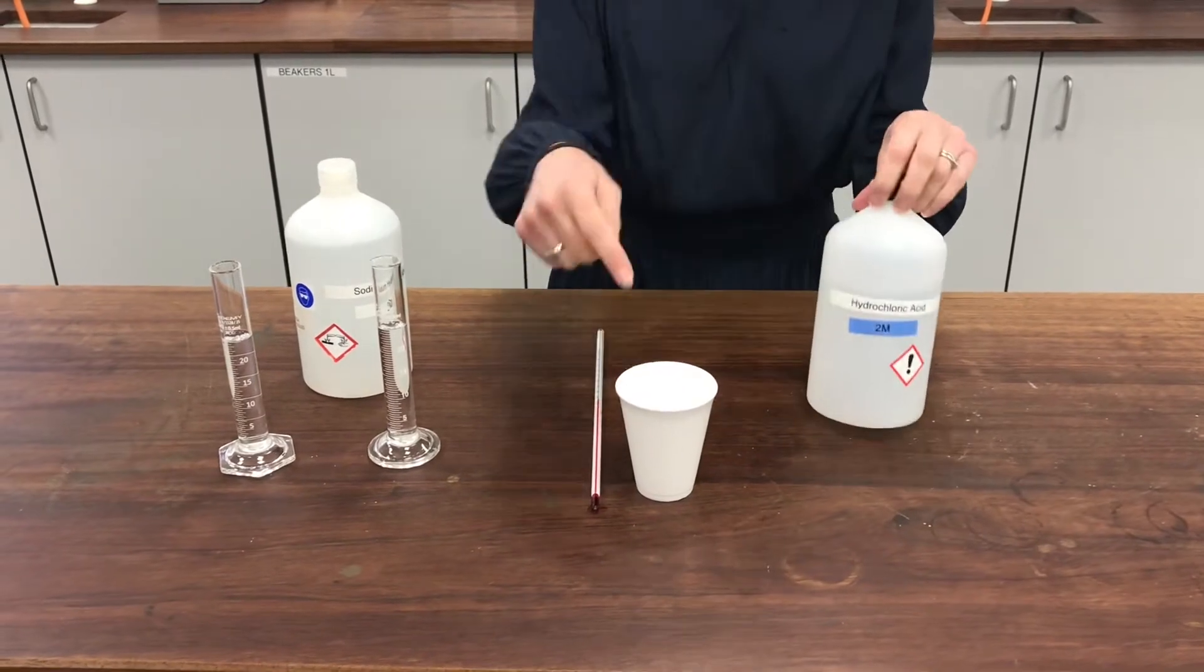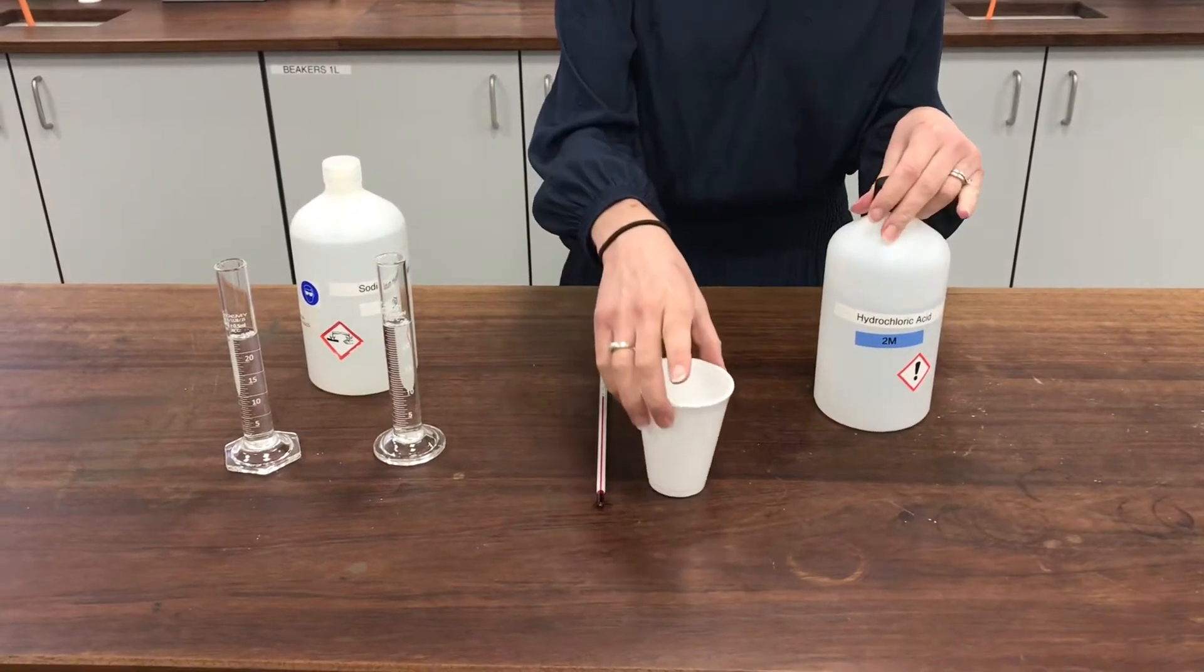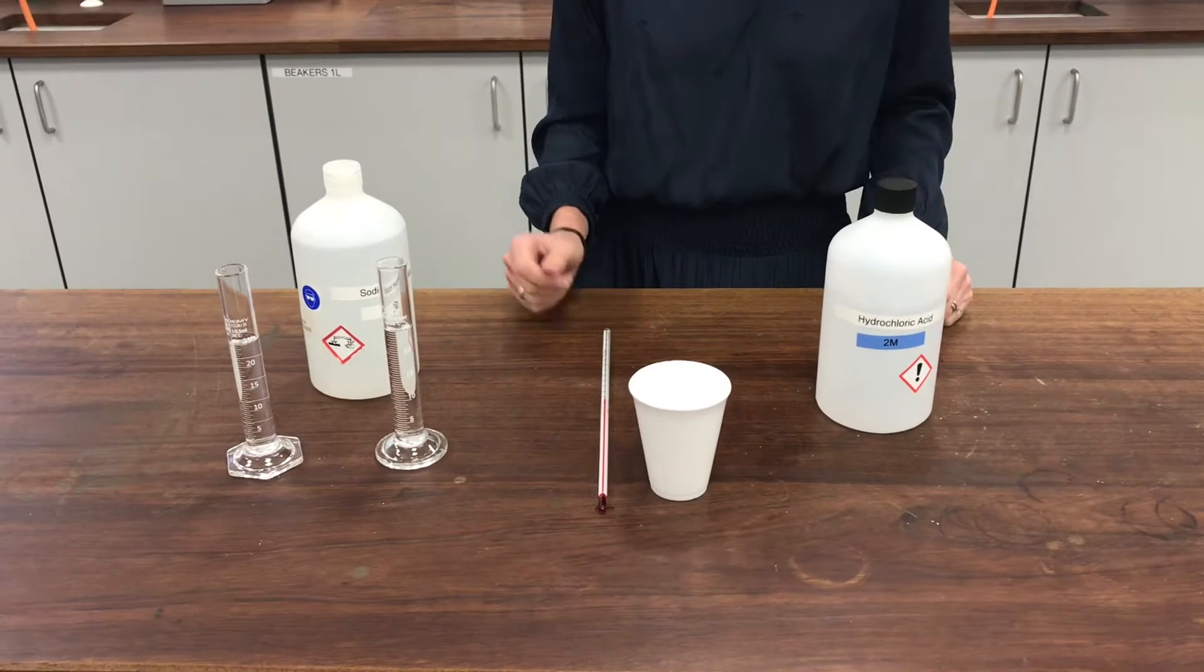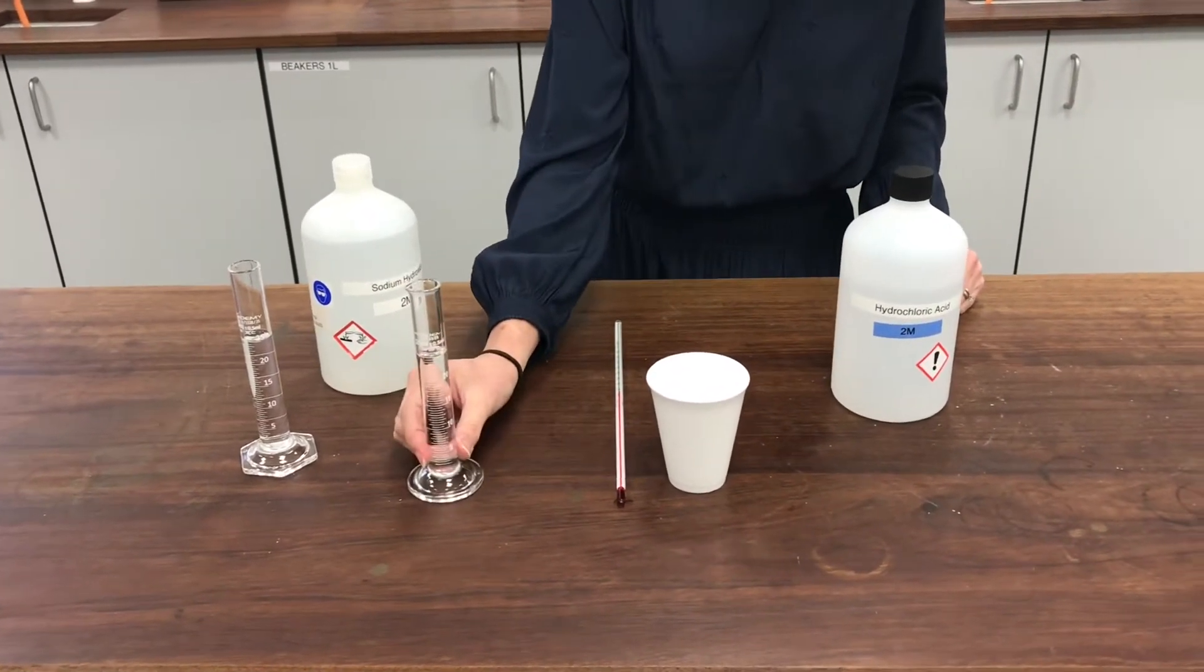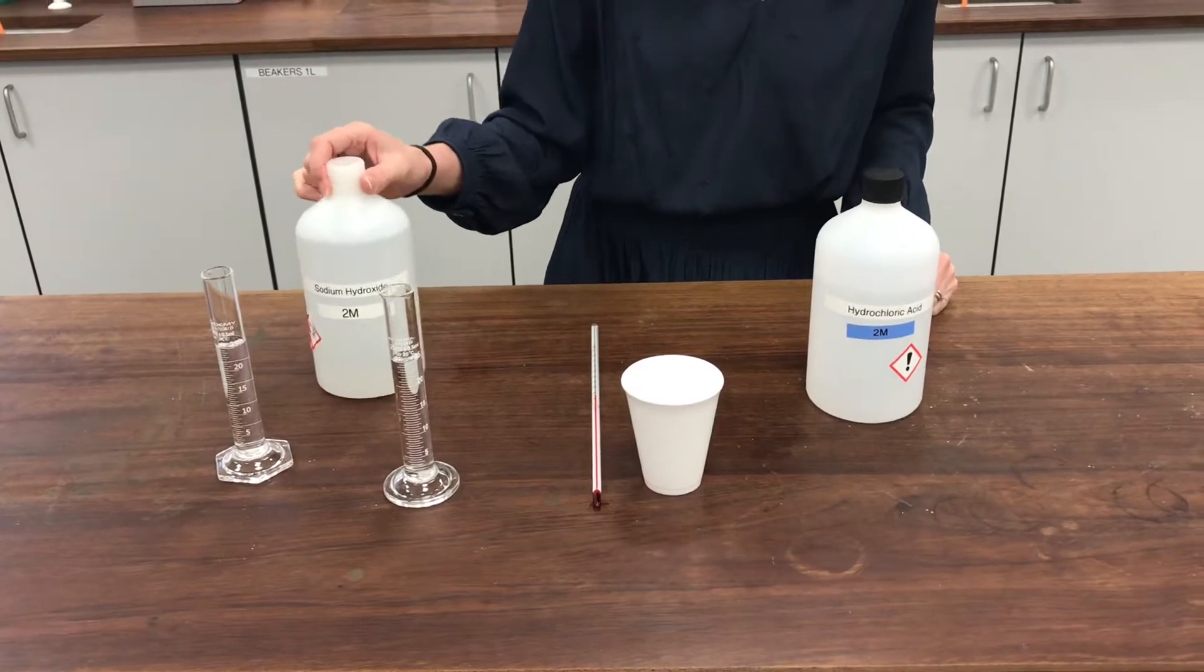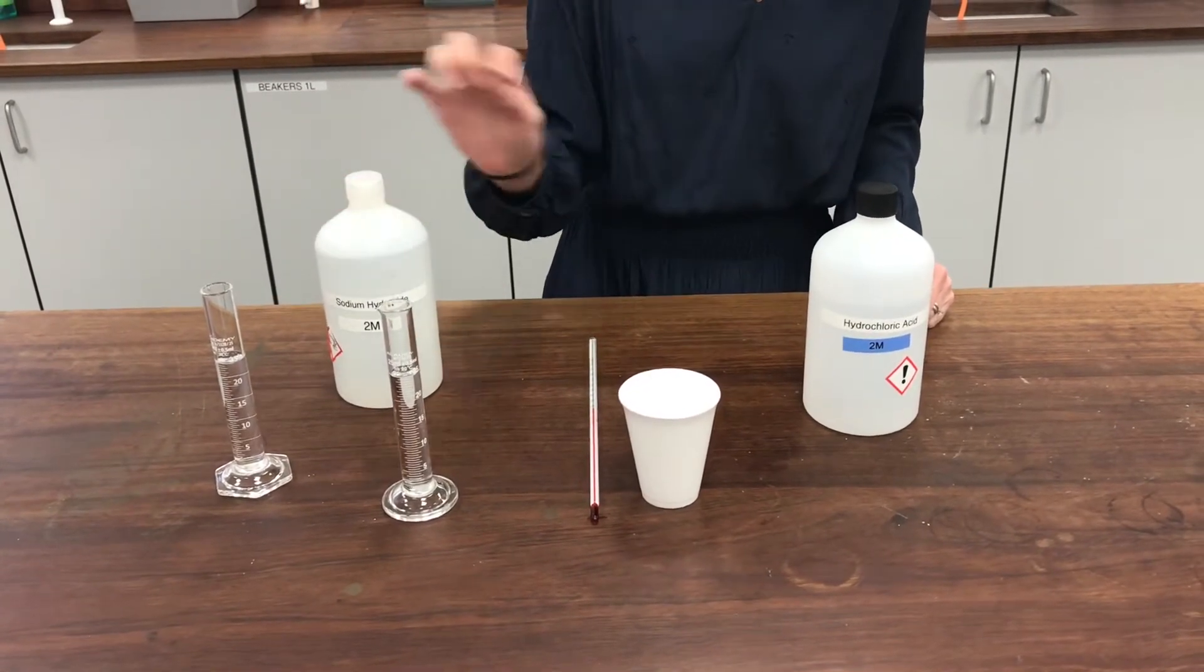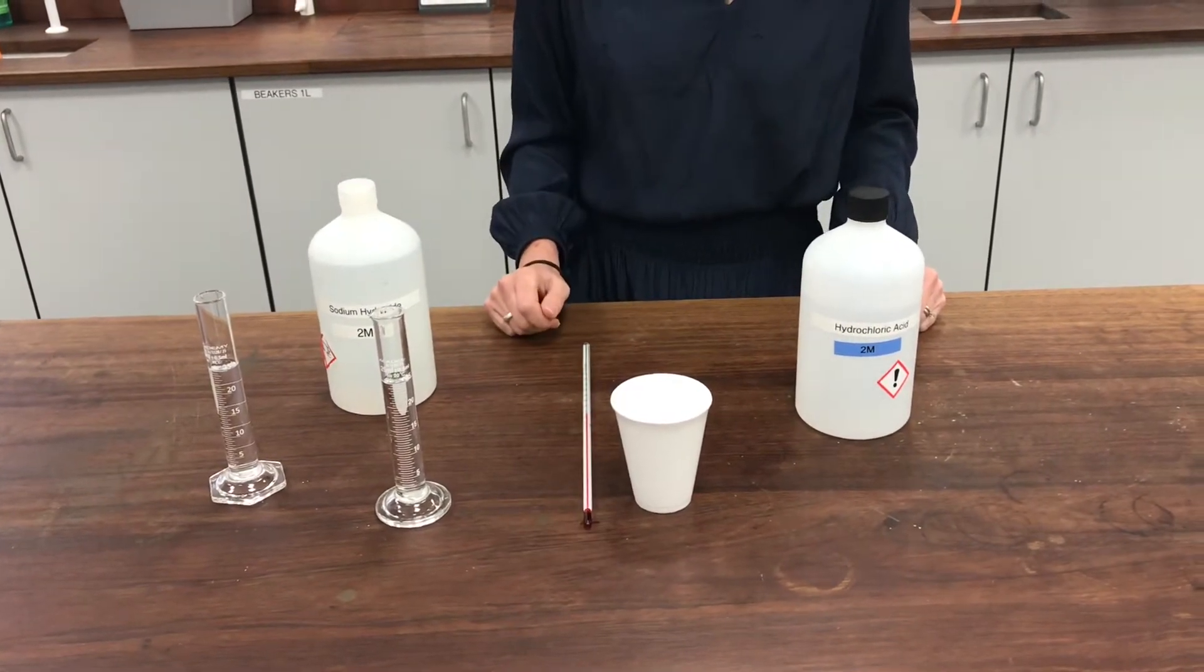So I've got some hydrochloric acid already in my polystyrene cup here. I've put 25 millilitres in and I'm going to take the temperature of it, the starting temperature, and then I'm going to add 25 millilitres of sodium hydroxide. This is an alkali and it should neutralise the acid that's in my polystyrene cup.